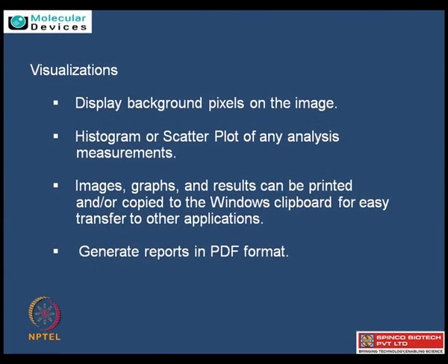Right. So let's talk about visualization, like how one can really generate a good image which can be further used for analysis. Once the image is acquired, the scientist immediately wants to know how my data has performed. You have given a very beautiful talk on how the controls work, and especially a few people even use bacterial controls, which are non-related to the biology as such. They want to see just the assay controls. So first they ask whether my assay has worked or not. Right. The best way for them is looking at the graphs which give differentiation in the level of backgrounds, and this can also be done at the level of different histograms and scatter plots.